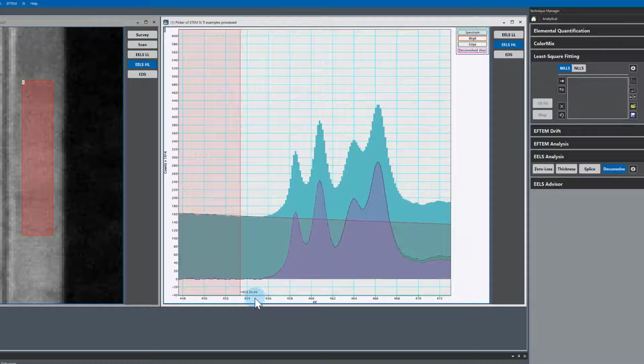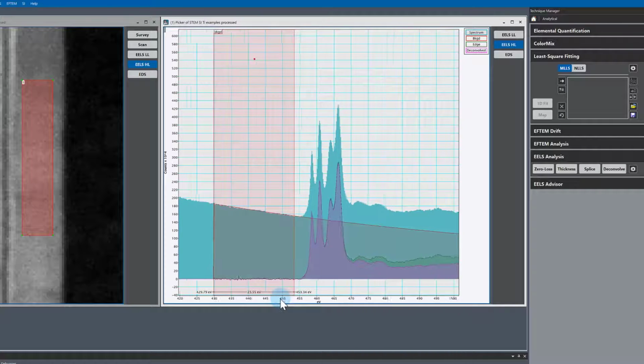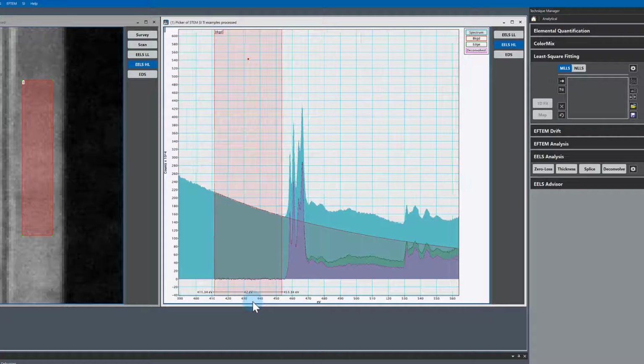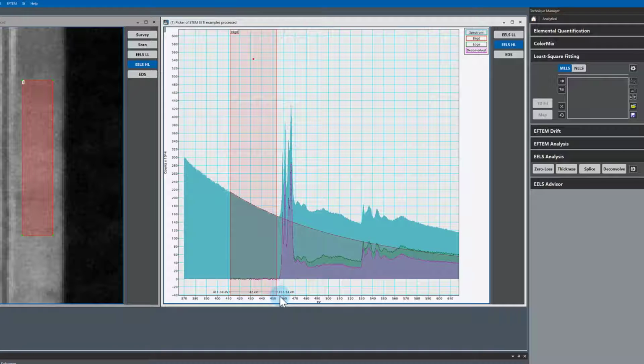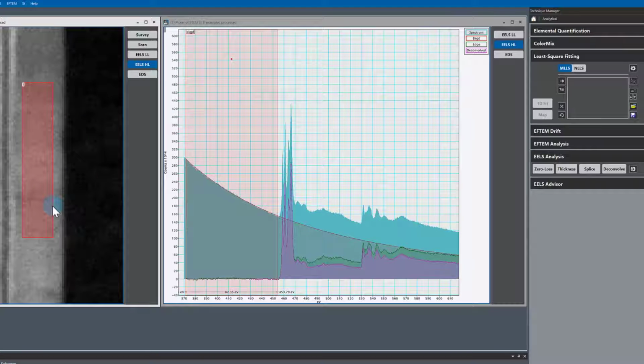So I probably won't go and deconvolve the whole spectrum image. Let's just do a straight up background subtraction. So let's do our rules of thumb. A third, this is 150. So we can actually probably go all the way out here. And yeah.